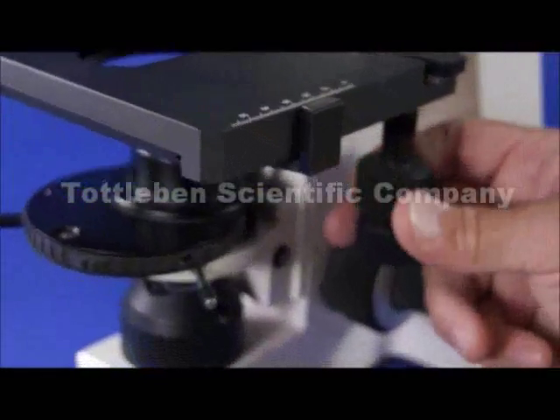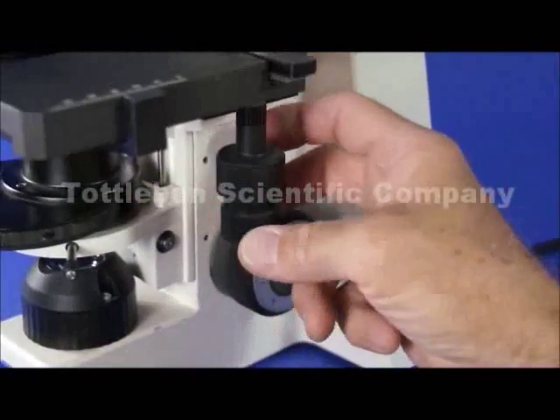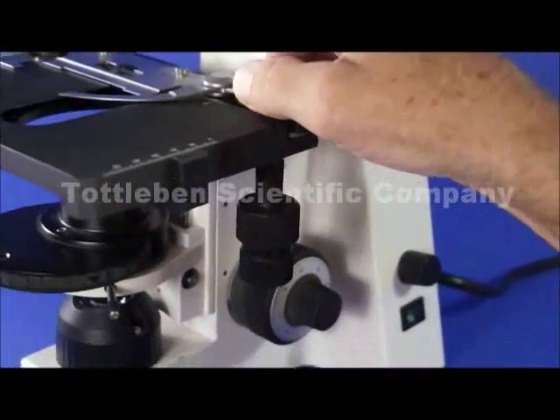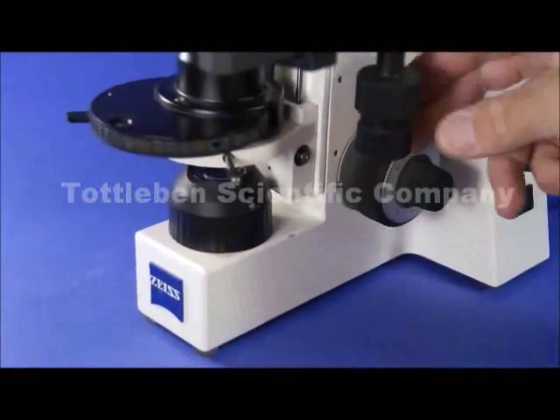Over here on the right inside you have a coaxial drive, low position which controls the XY movement of the stage. Specimen holder with a spring clip to accommodate almost every size of microscope slide there is.